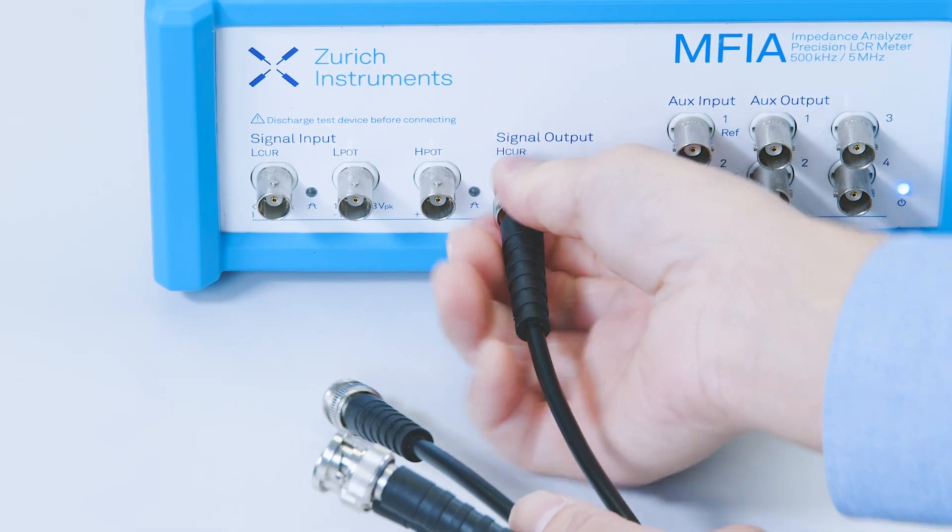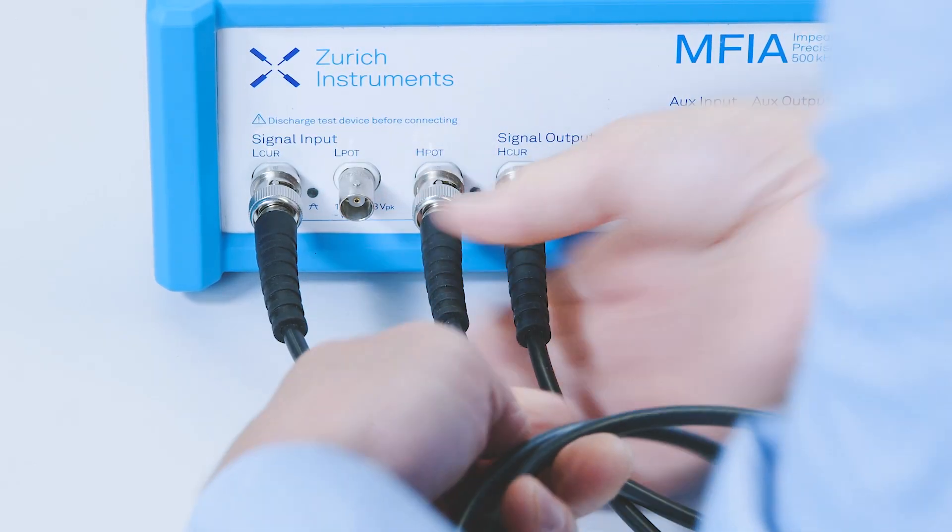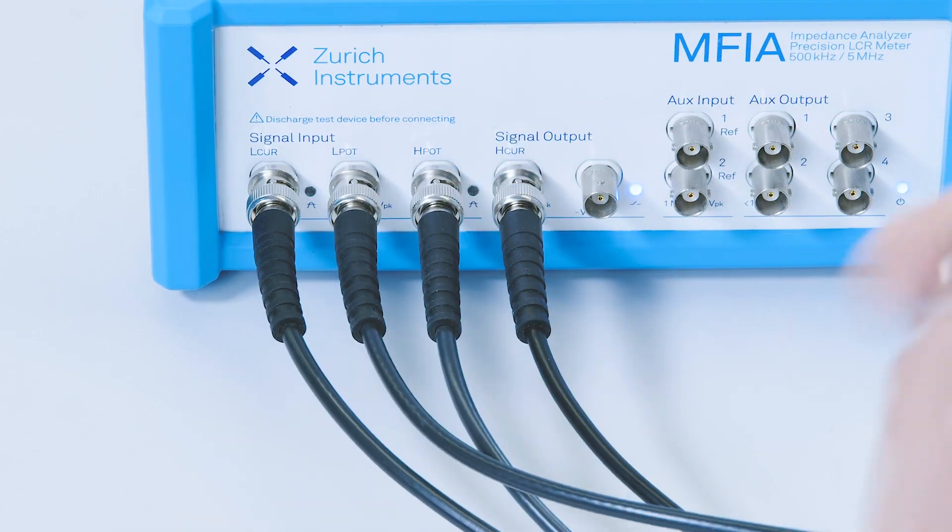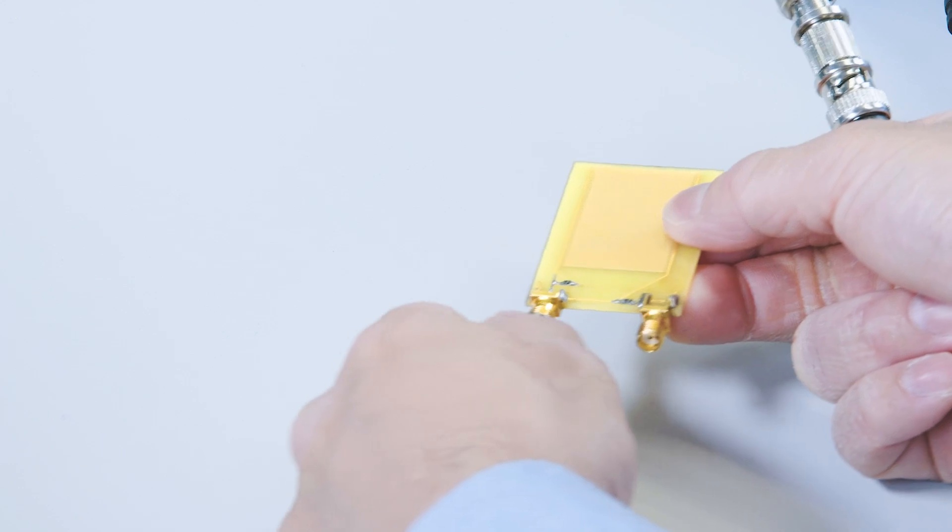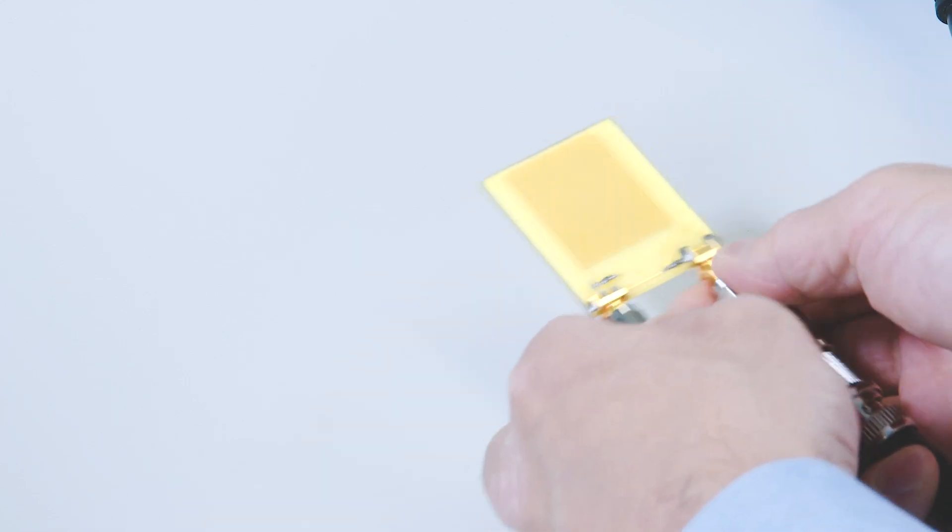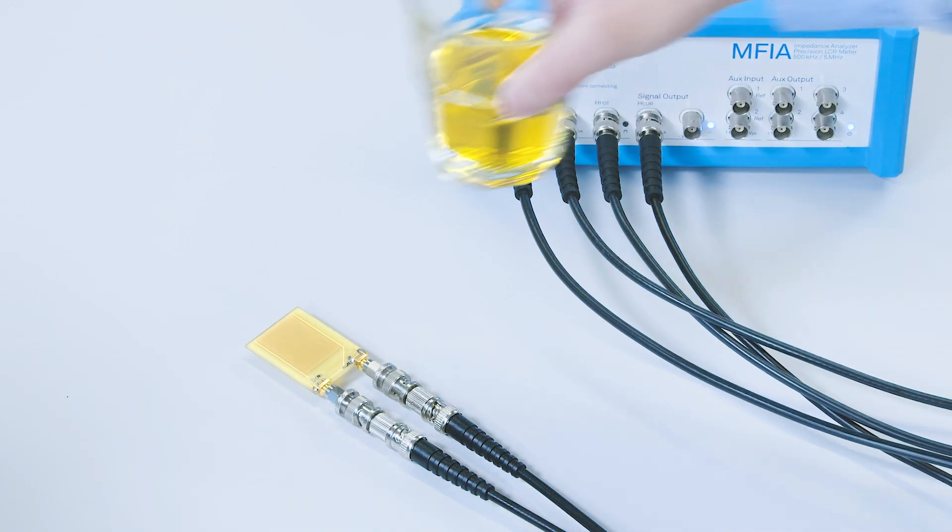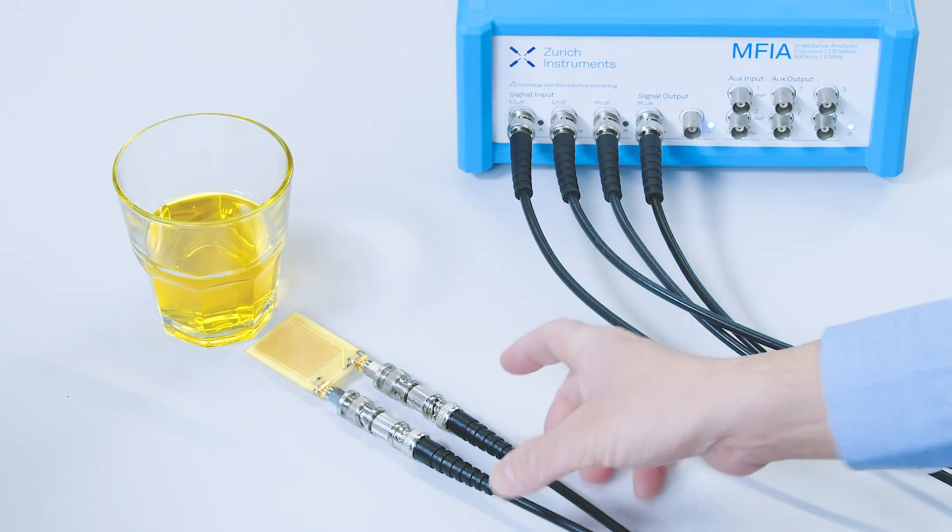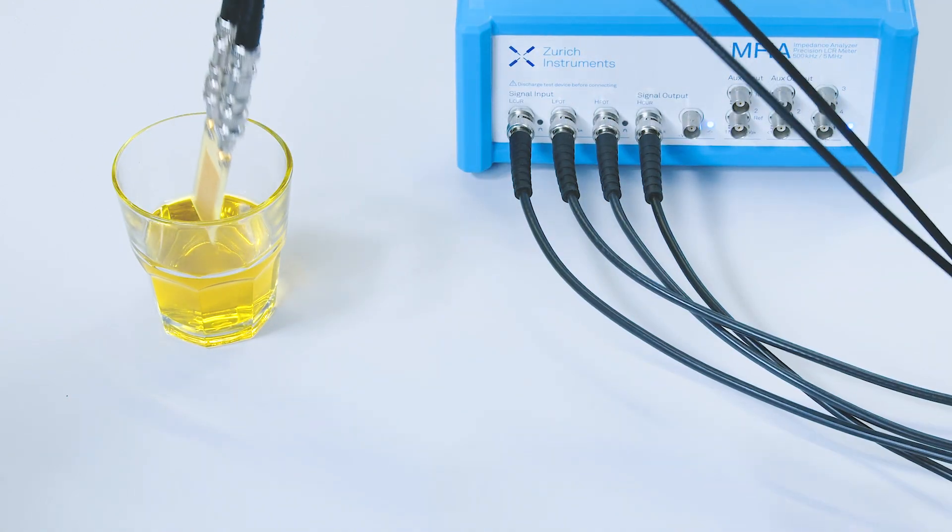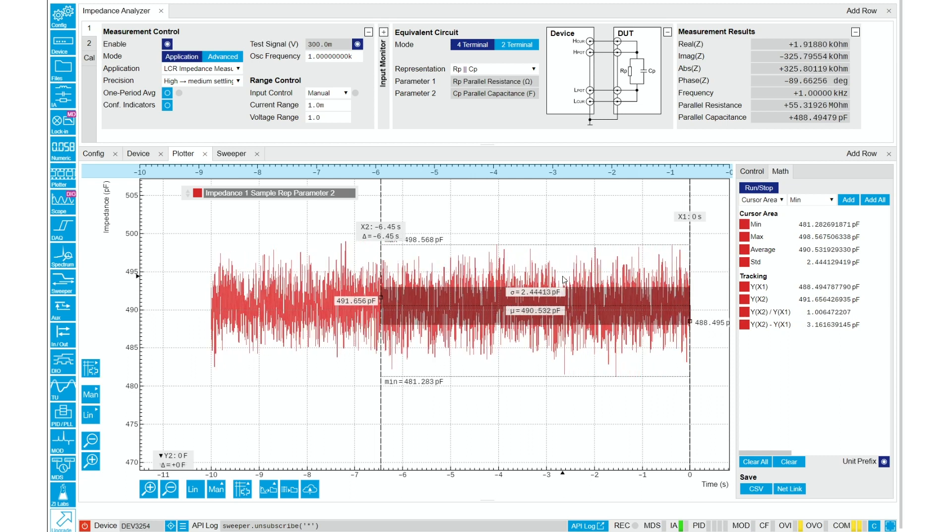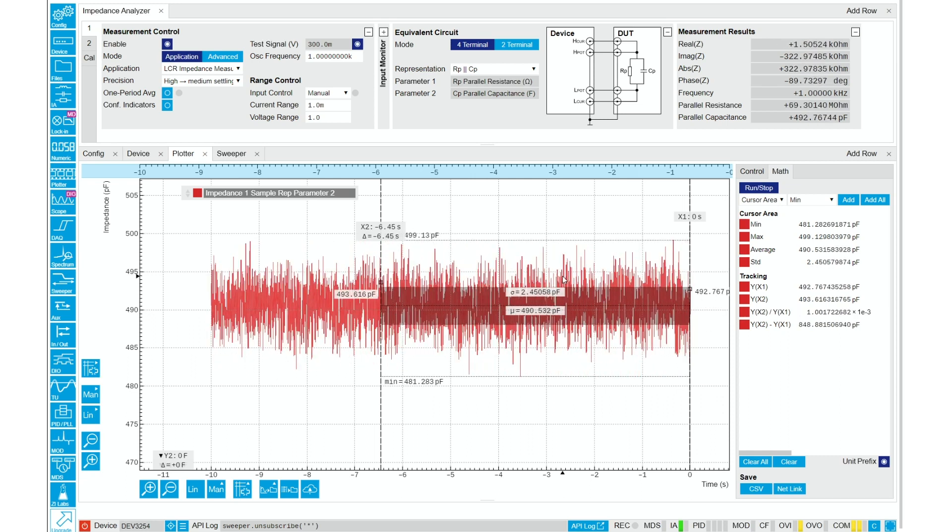Now I'm connecting the cables to the MFIA and to my electrode. I'm going to put my electrodes into this glass of olive oil. So here's the measurement with an interdigitated electrode.